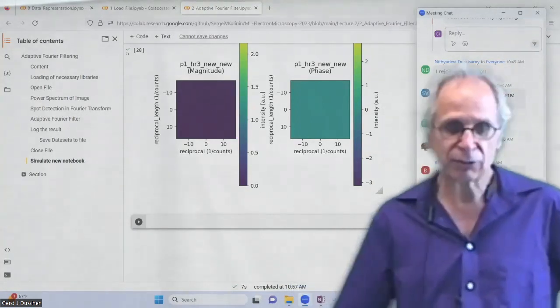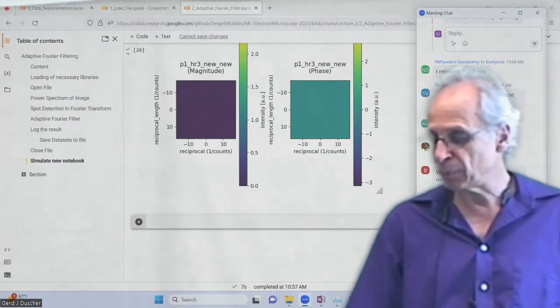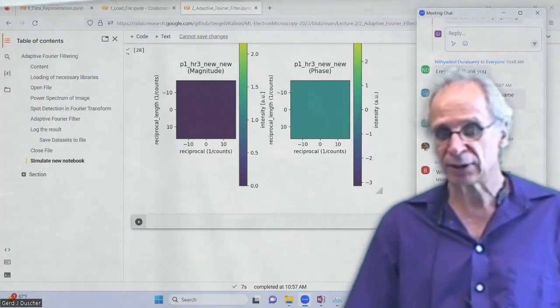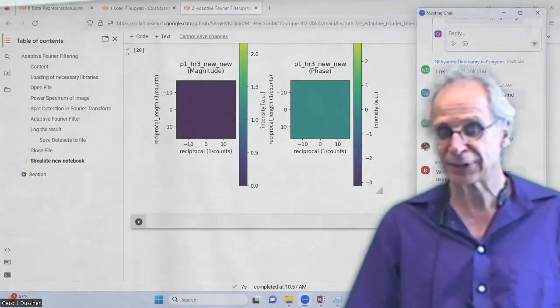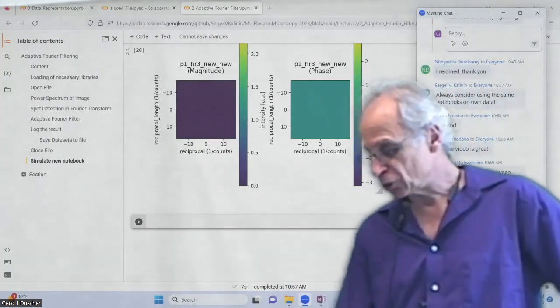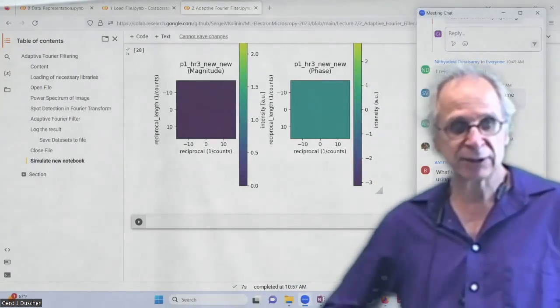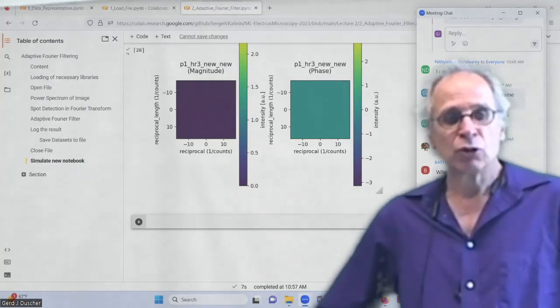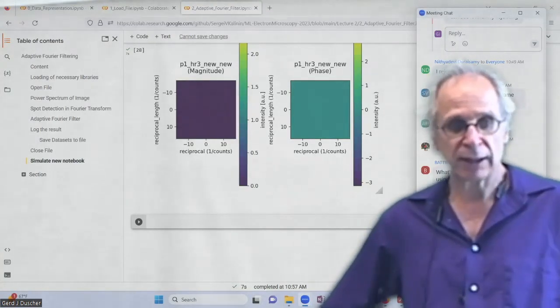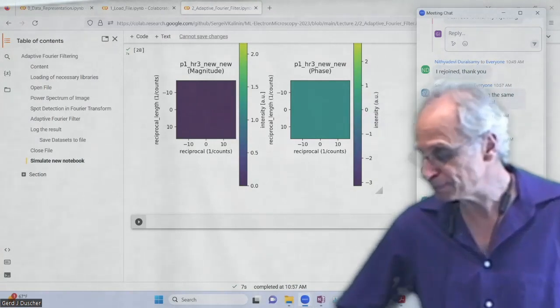And the data format we use there is called pyNSID. And Rama will talk more about this next week on Tuesday. That, at least, is what I was told. The idea is to make it as universal and as flexible as possible and have all the relevant data in there. So, okay.